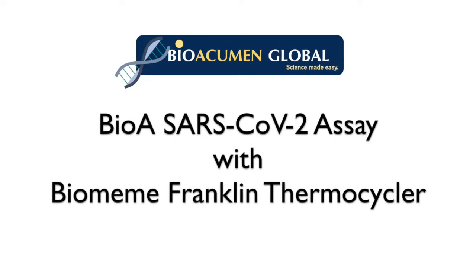In this video, we will demonstrate how to use our BioA SARS-CoV-2 kit with the Biomeme Franklin Thermocycler.